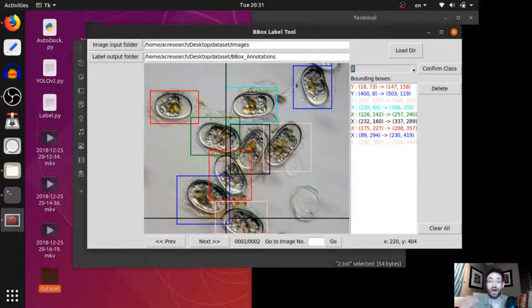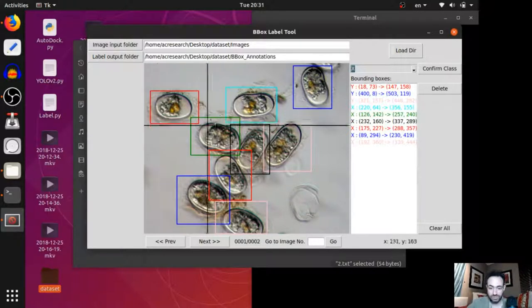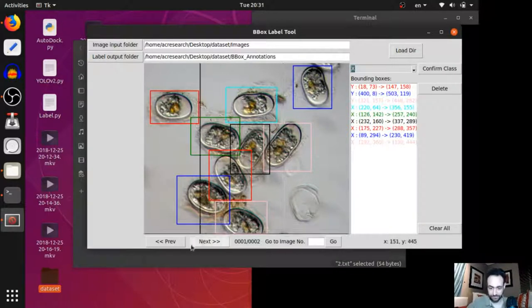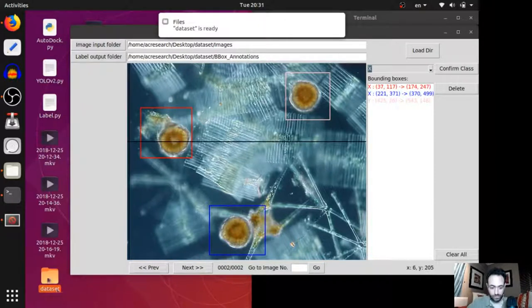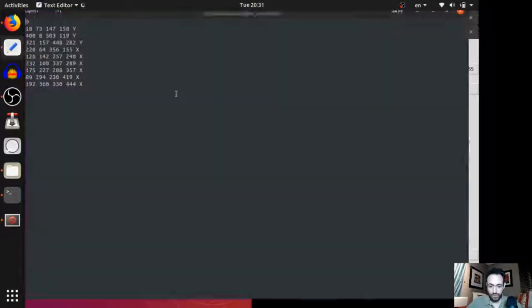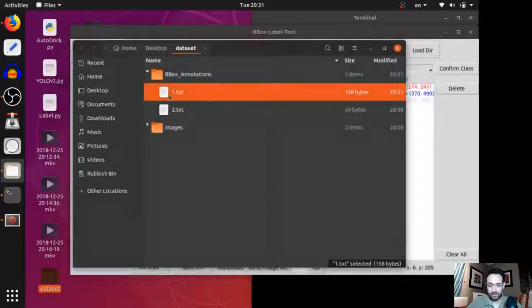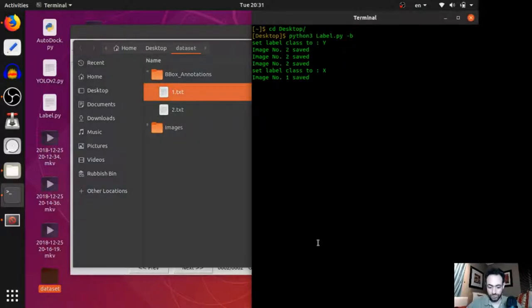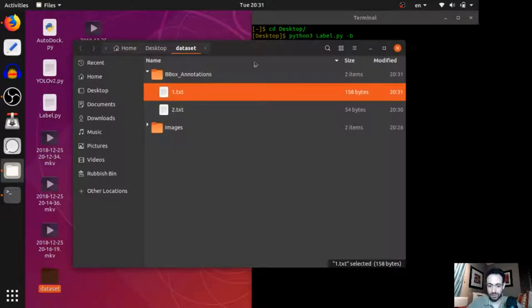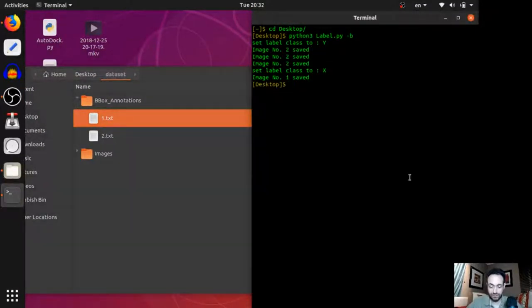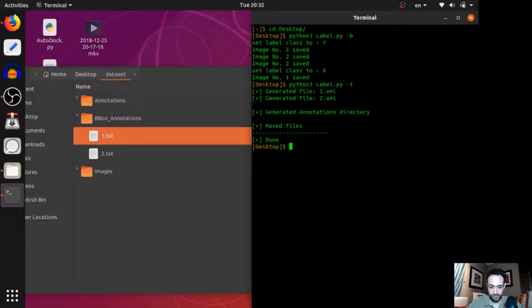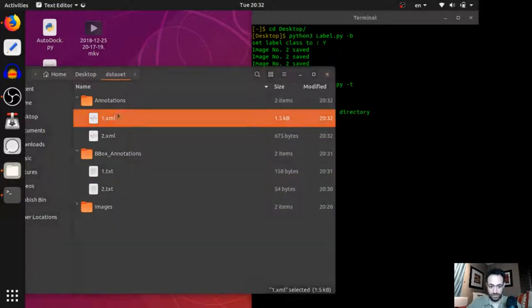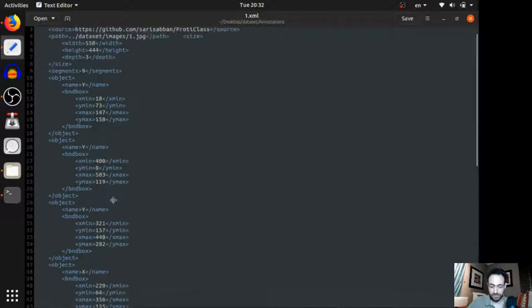And now, these images have bounding boxes around the objects that we are interested in. What we will do later is, we will translate these texts into... We can close this program now. We will translate this text file into an XML file so the neural network can read it. So, we will say, Python 3, label, and translate. There we go. Translated to an XML file. It's exactly the same information but written in a different way, specifically for the neural network to read.